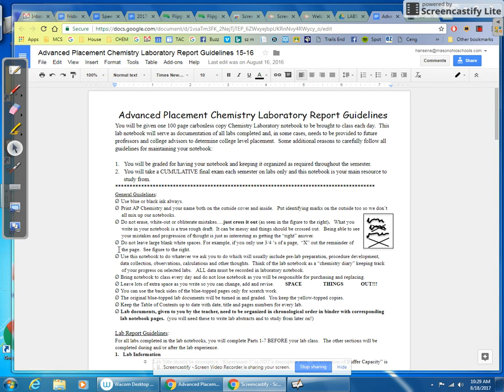If you make a mistake, that is totally acceptable. Our lab notebooks are rough drafts. So please, if there's something you want to cross out, don't obliterate it. Just take your pen and put a line through it. Ms. Schneider and I should be able to see what you had, all your mistakes, just as much as we want to see your corrections. So just cross it out gently.